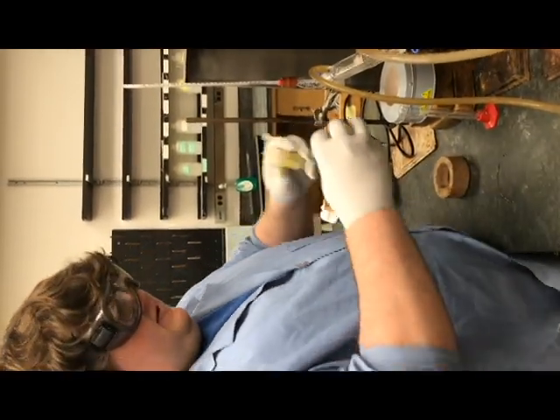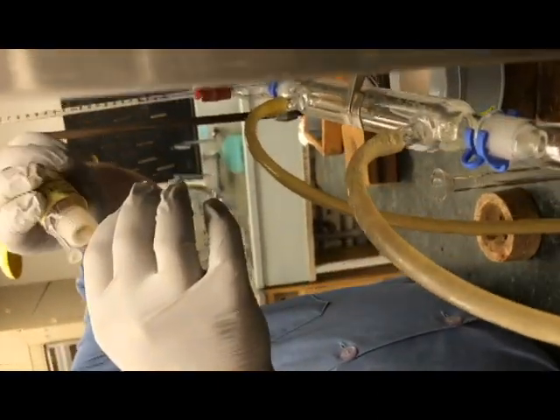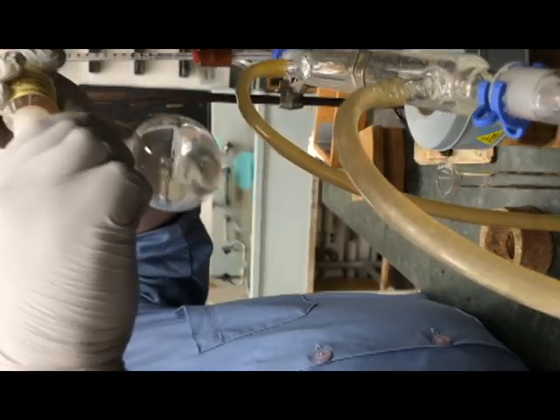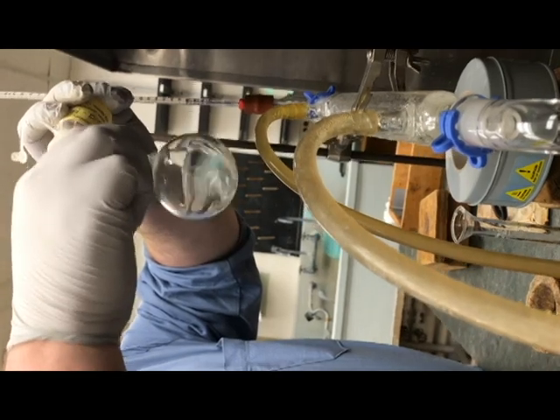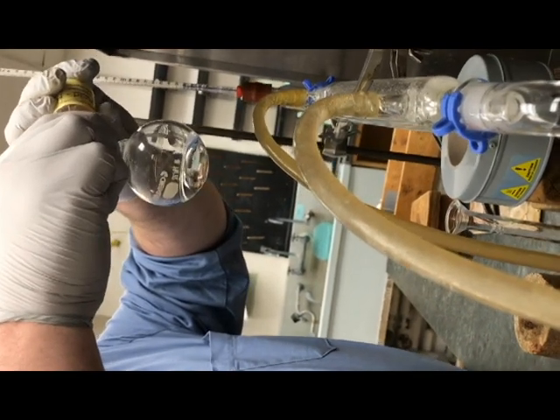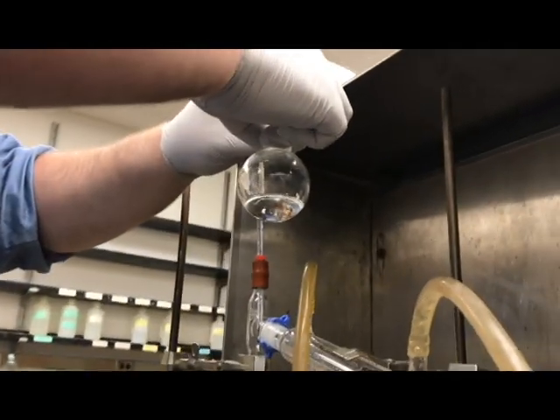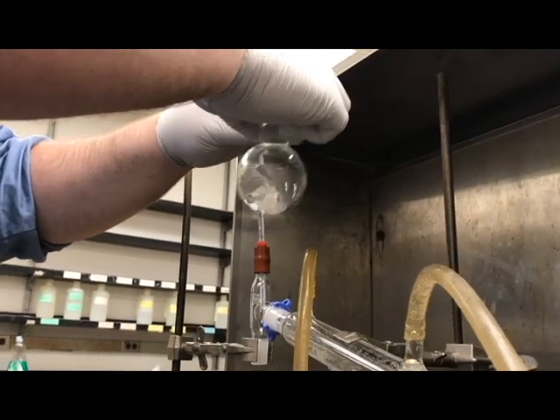So, we're going to put in 1-ish drop at a time, swirl around for a little bit, make sure everything's all evenly distributed. And we're just going to keep adding until 10 drops have been fully added. Once the 10 drops have been added, we will then continue swirling this for 5 to 10 minutes.